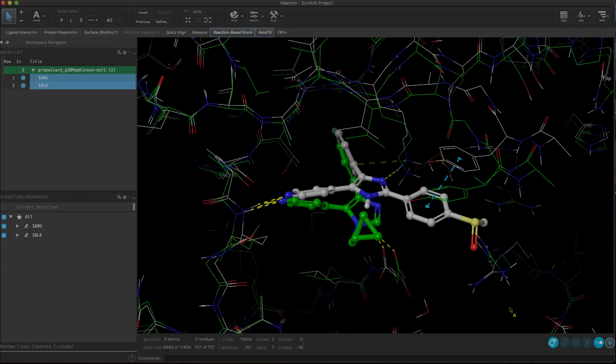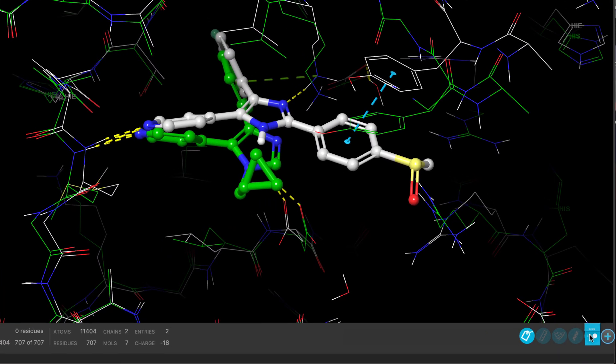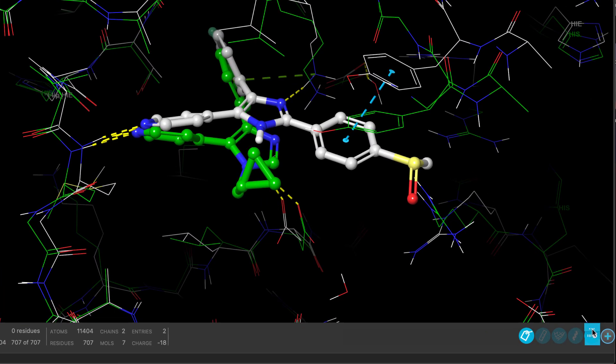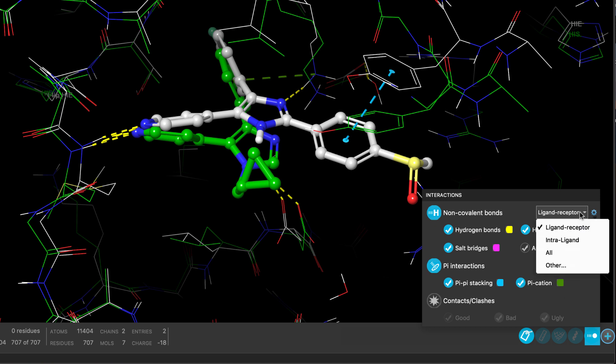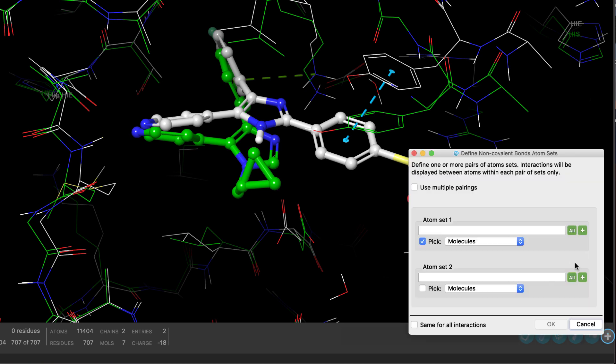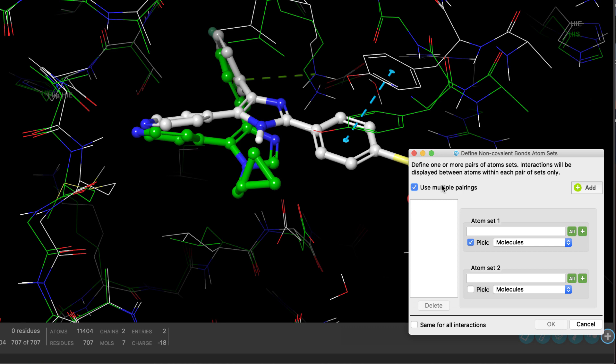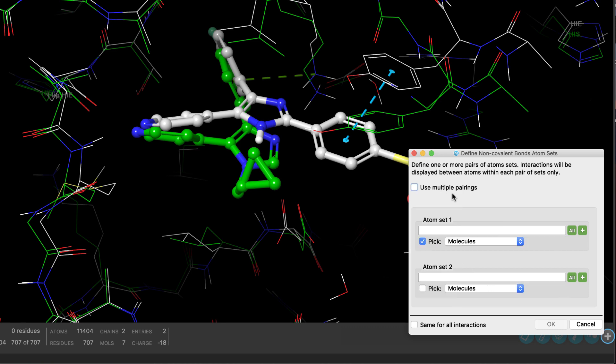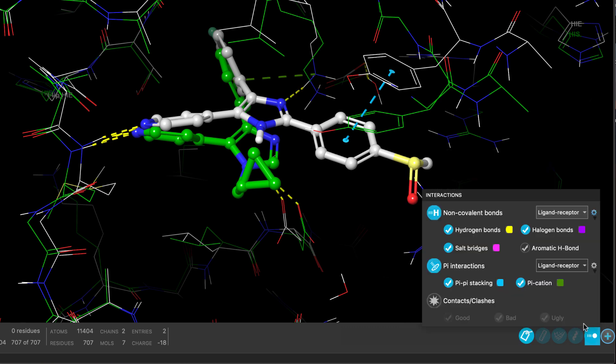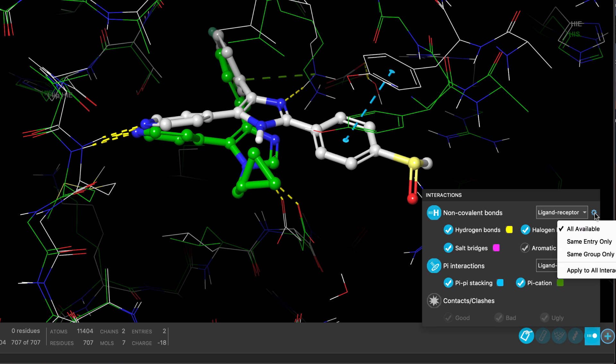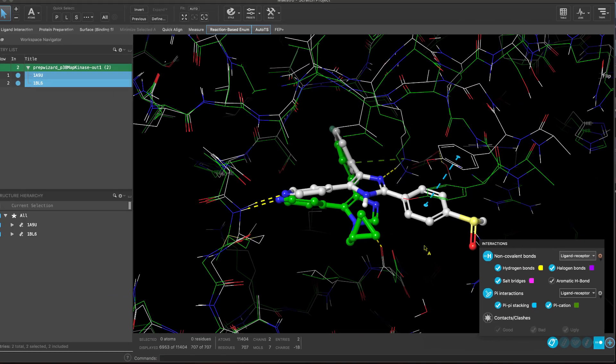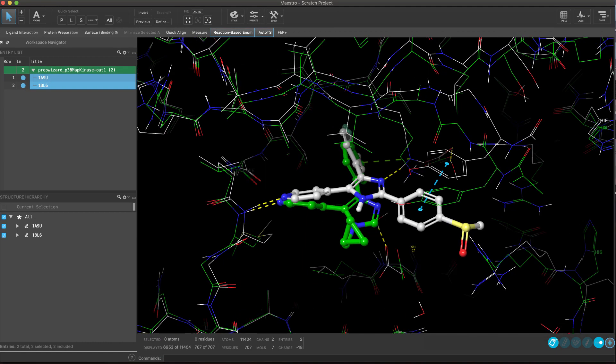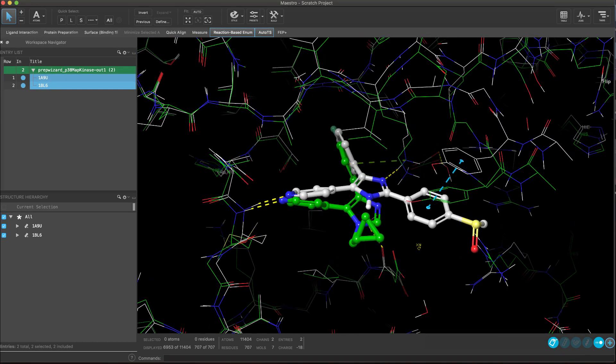Down in the Interactions toggle, there is now finer control over non-bonded interactions. There's a new ability to set up multiple sets of interacting atoms and a simple way of showing only those interactions that occur within the same entry or project group. This can help avoid mixing up interactions when overlaying multiple protein ligand complexes in the workspace.